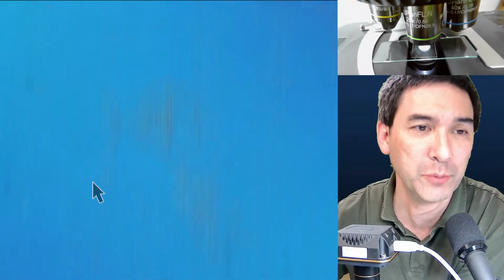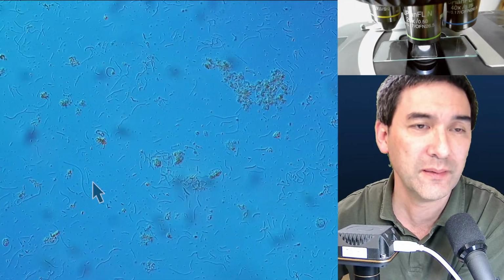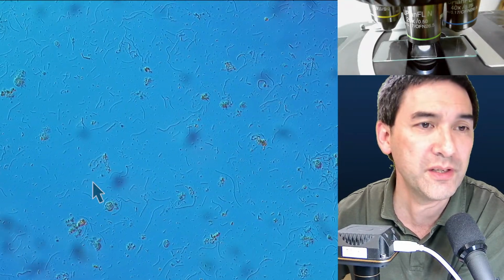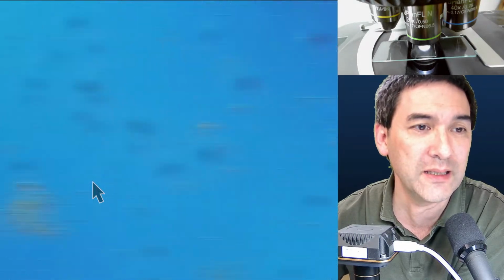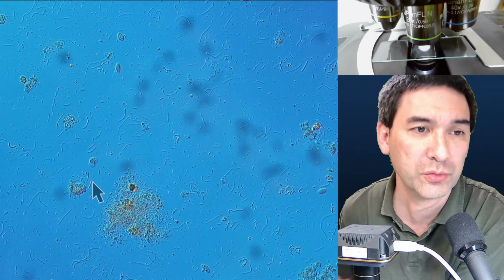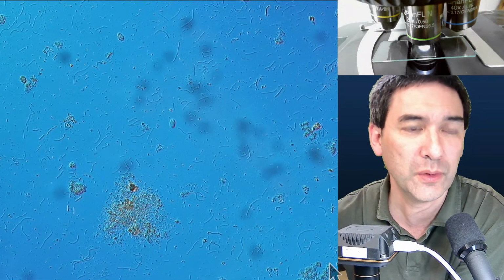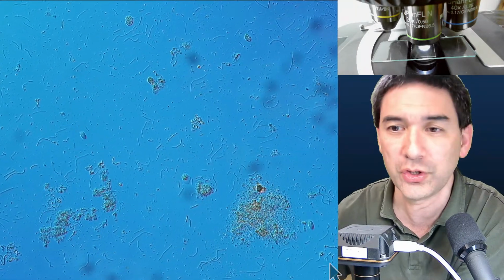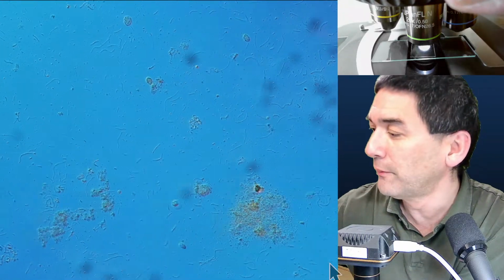This is also a sample where I would be careful a little bit. You don't want to mess around with this sample, because you don't know which bacteria these are. You do not have to assume that they're automatically dangerous, but you don't know what you're growing. It's the same as when you decompose some food: you don't want to eat it, or touch it. So this is now at 20 times magnification, and let's go up further.